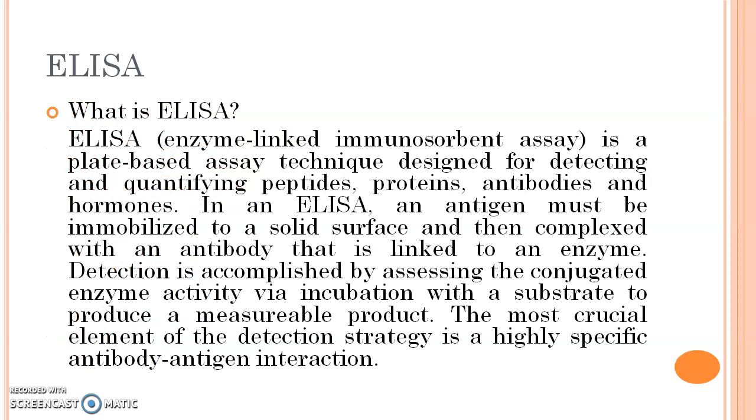So what is ELISA? ELISA is enzyme-linked immunosorbent assay. It is a plate-based assay technique designed for detecting and quantifying peptides, proteins, antibodies and hormones. In an ELISA, an antigen must be immobilized to a solid surface and then complexed with an antibody that is linked to an enzyme. Detection is accomplished by assaying the conjugated enzyme activity via incubation with a substrate to produce a measurable product. The most crucial element of the detection strategy is a highly specific antibody-antigen interaction.